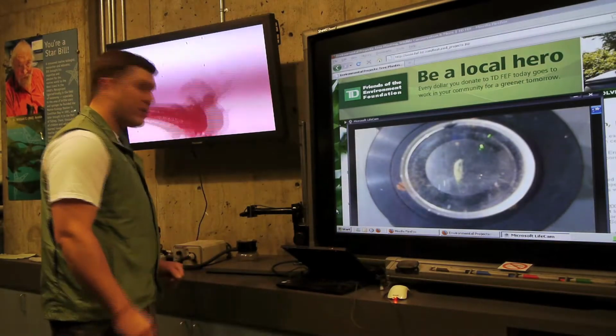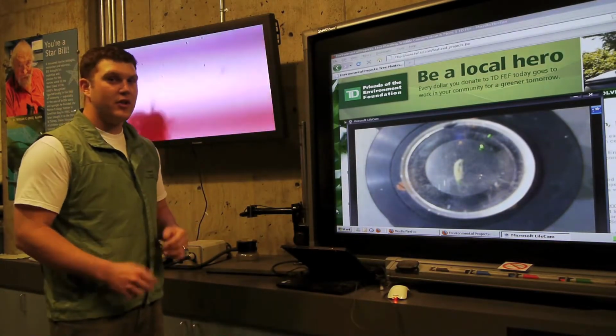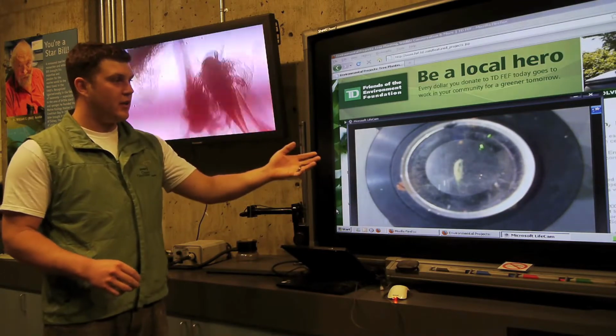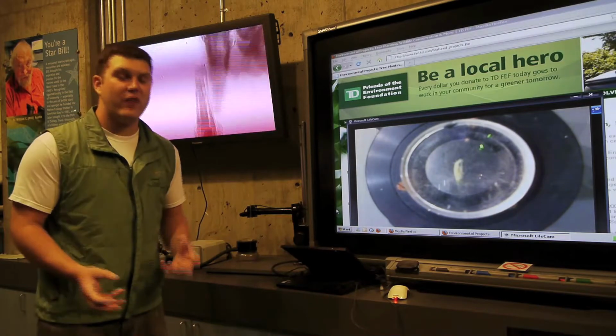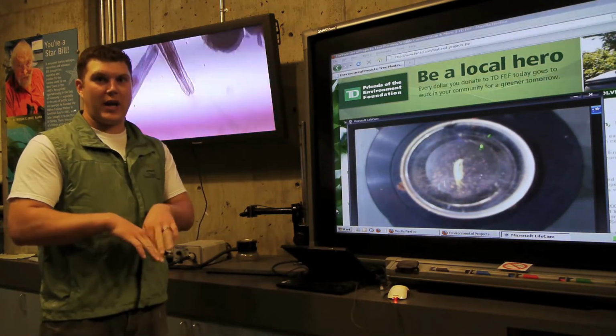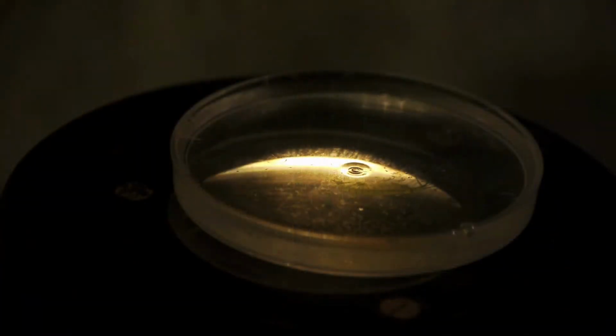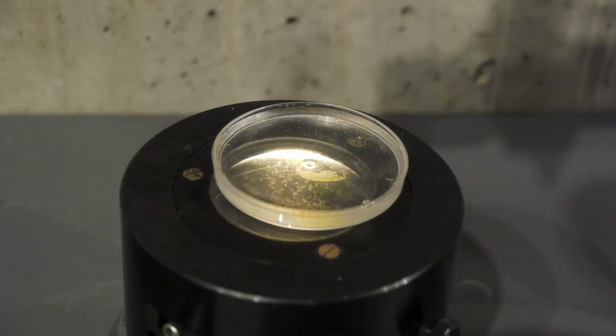This amazing little piece of equipment here is called a dark field illuminator. What it allows us to do is see plankton and invertebrates and larval fish in a whole new way. It lights the object from all sides, taking away any shadow, and if it's a clear invertebrate, say like a mysid shrimp, it basically enhances the exoskeleton so we can fully see that animal.